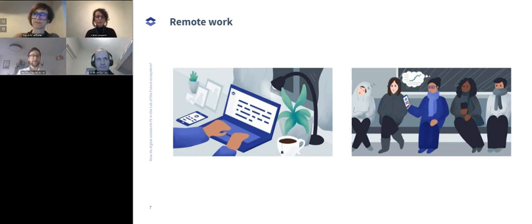What I clearly see here on the market is, of course, again, every single vendor has their own approach and their own system. And in a bigger life science community, well, in your lab you don't have everything from one vendor. Meaning you have 8 headsets lying around, and that comes again to IT security topics, because do you really give all of those vendors access to your network? And I think there we really lack smart solutions.